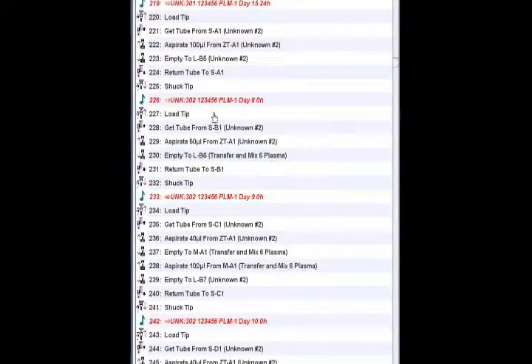Scroll the steps column to step 226. 50 microliters of the sample from SB1 is transferred to LB6, making the twofold dilution. The formatter does not mix this well since a transfer is not made. LB6 is the destination well.